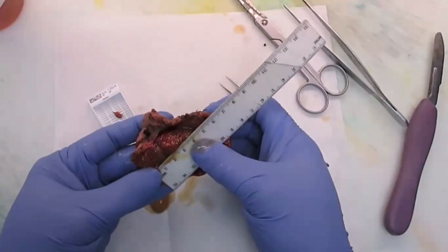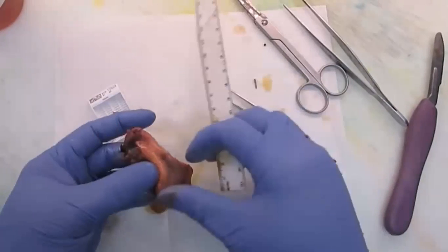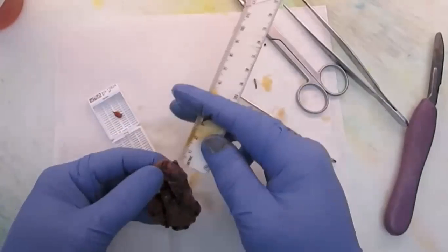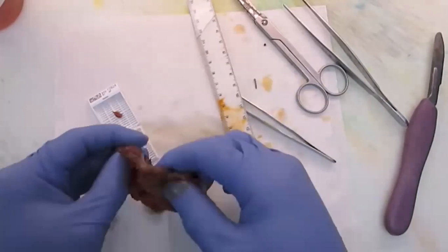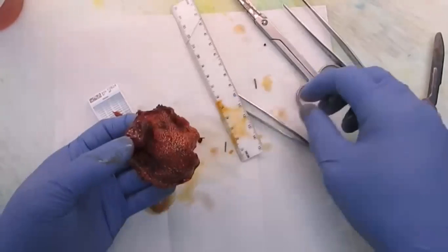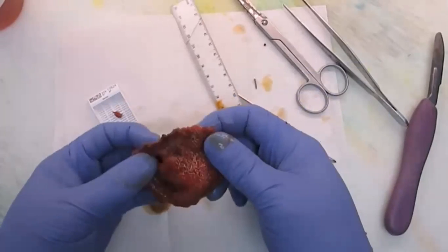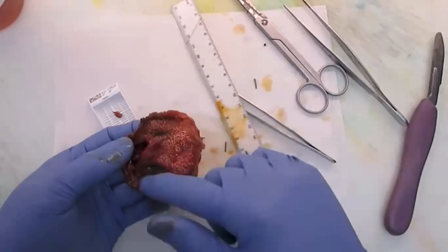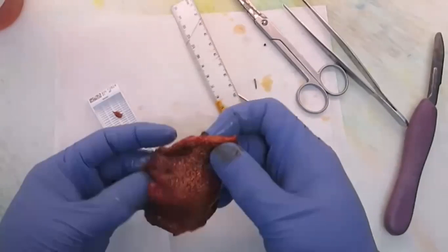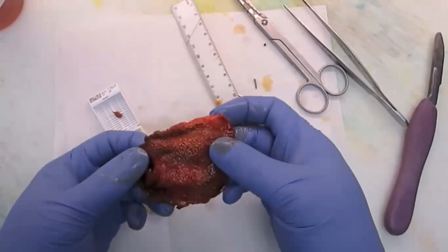6.0 cm in circumference, close parentheses, period. The serosa is tan pink, smooth and glistening. There's a rough hepatic bed with cautery artifact. 0.2 cm at the margin of incision, period. So now talk about the inside. So you'll see that the mucosa is kind of like tan brown or red brown. Yeah. So if there is an abnormal color, we have to note that. Like for example here, that's the sign now of cholesterolosis. And so we're just going to describe it as diffuse yellow streaks.